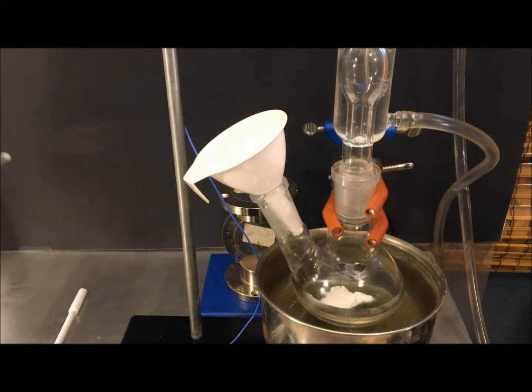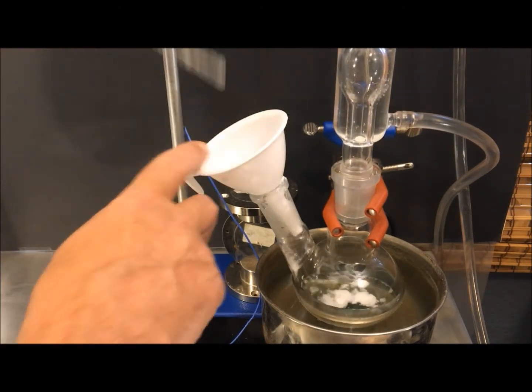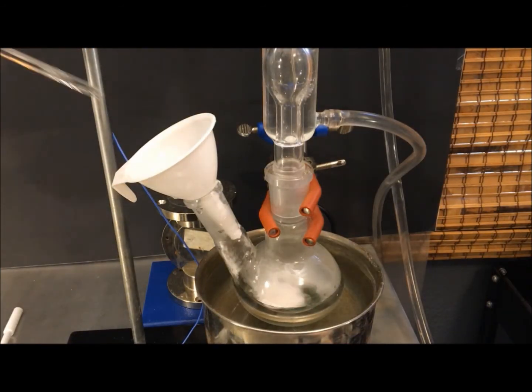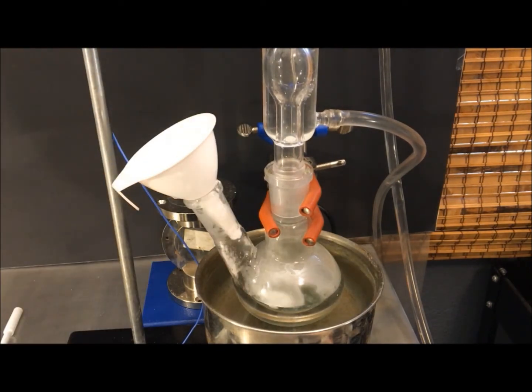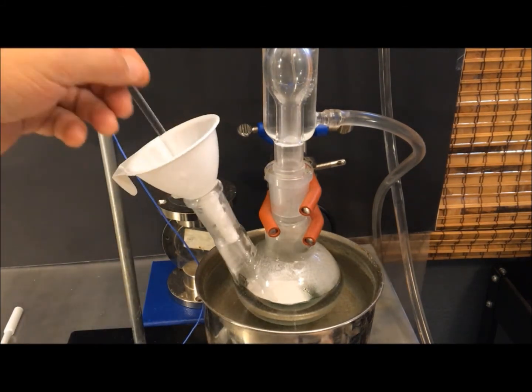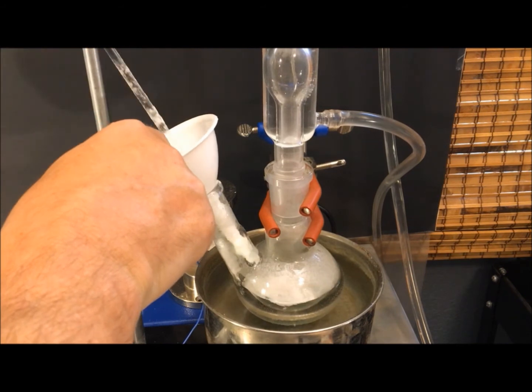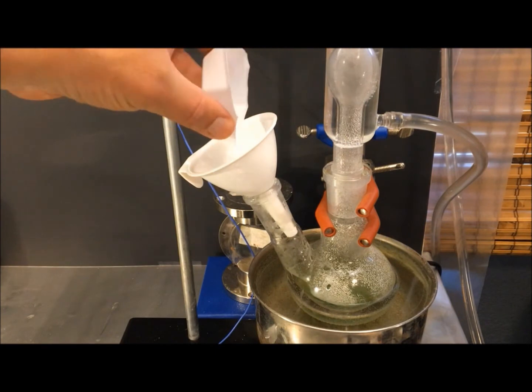It dissolves extremely slowly. It forms like this giant glob that I wound up having to fight with a stick for about an hour. So it's actually best to do this in a separate beaker beforehand. You could heat it up a little bit and not have to pull your hair out. Also add it in small amounts, otherwise the glob gets big and dissolves even slower. It will eventually dissolve though, and then the last thing you'll want to do is add the ascorbic acid.